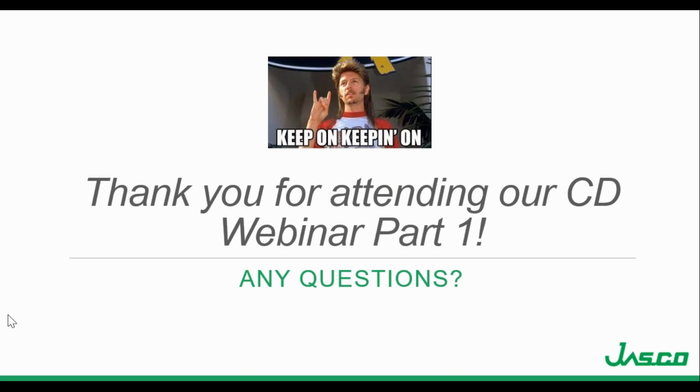How long does it take to do a measurement? That is 100% going to depend on the wavelength range you're probing and the digital integration time, and this is going to be a lot of measurement stuff that I'll get into in our next webinar. But if you're doing secondary structure and you're just doing one accumulation, it takes about 40 seconds. If you're doing a little bit more than secondary structure, I'll estimate a minute, but again, it's really going to depend on the parameters you're using and where you're looking. I believe we will have this presentation available for download.